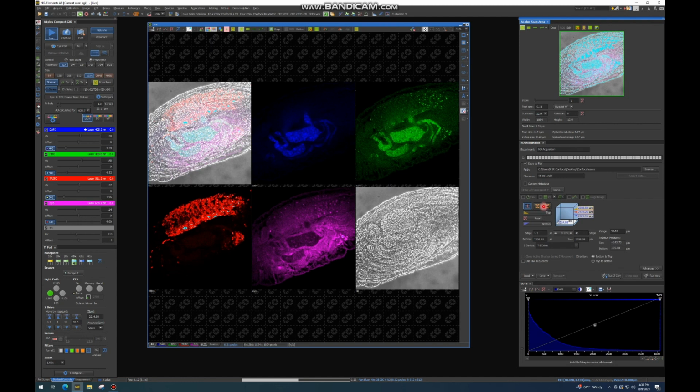So here is taking a Z-stack. Z-stacks are the most common types of images acquired on a confocal because, like I mentioned earlier, the beauty of the confocal is it allows you to get a single plane resolution of your sample.